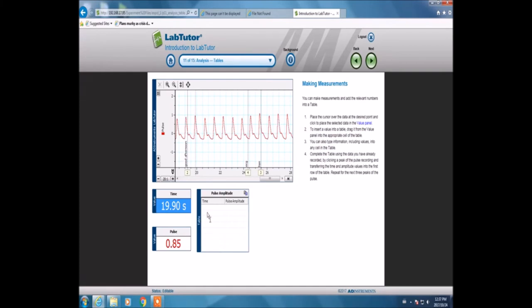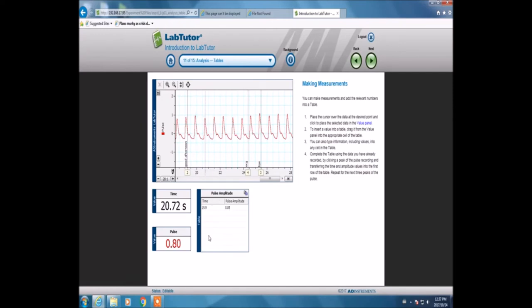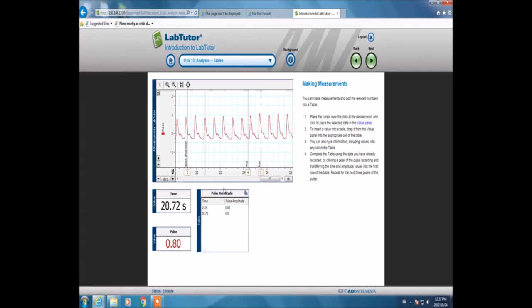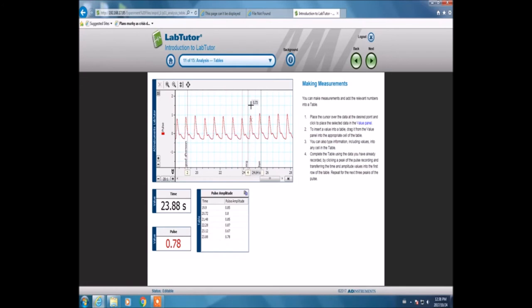You have to place the marker. You don't have to place it exactly on top of the peak, but you can place it above the peak and it will give you the reading of the peak height. We've almost filled in the whole table. After filling in the whole table, we'll move on to the next part of the experiment.